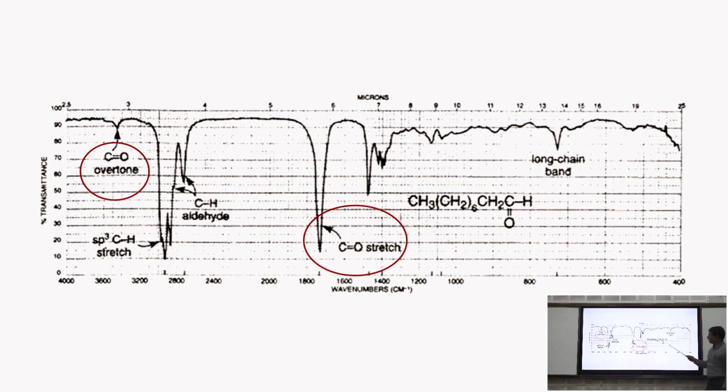So you see this carbonyl band. This is carbonyl, and this is the fundamental absorption band.